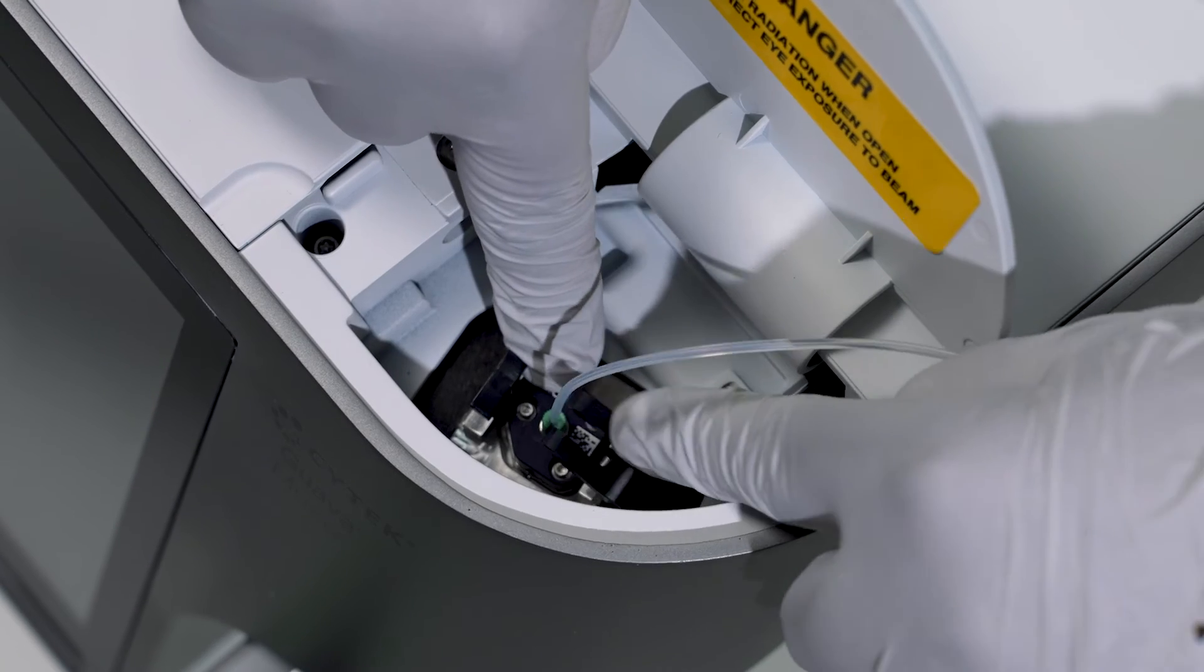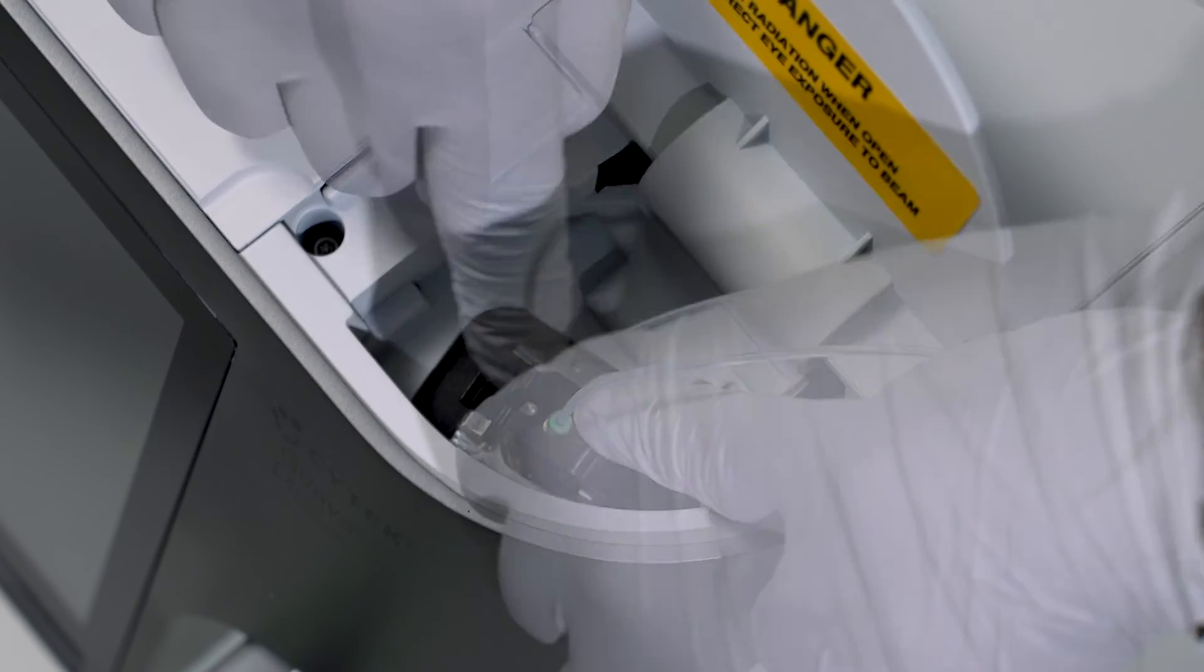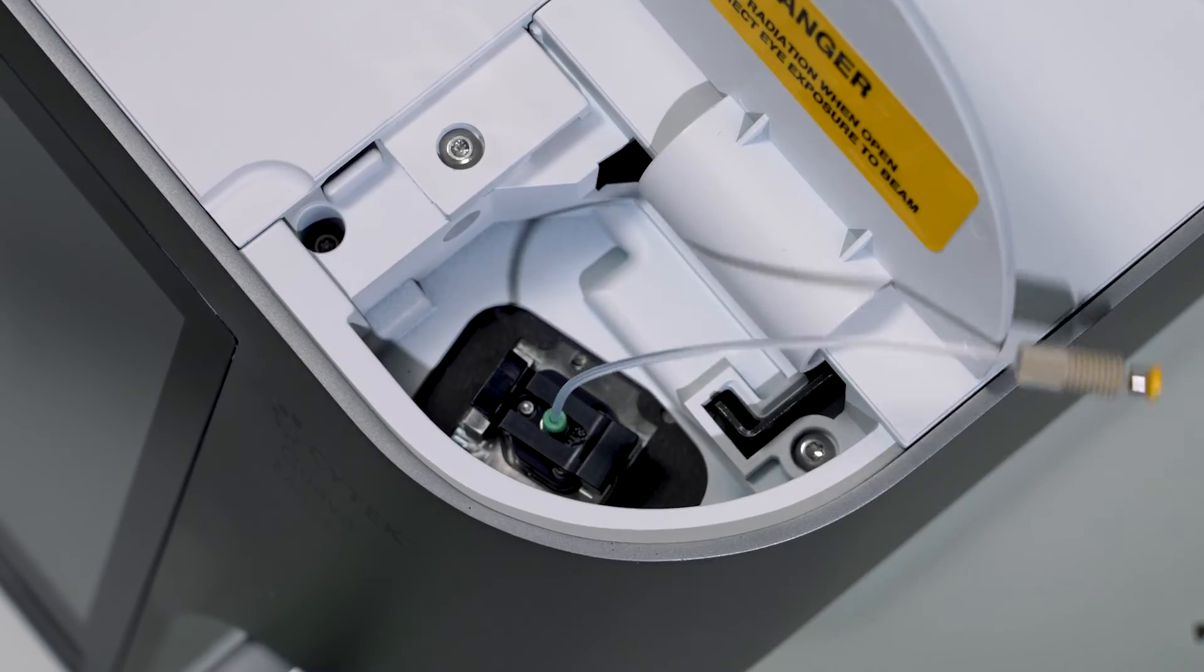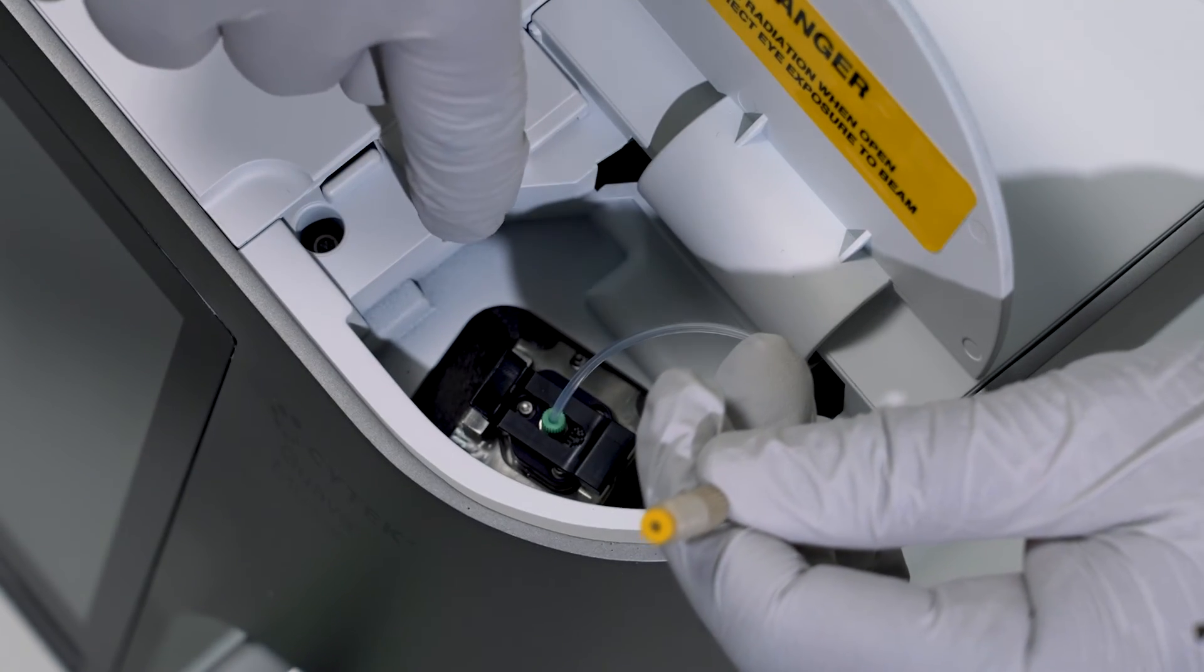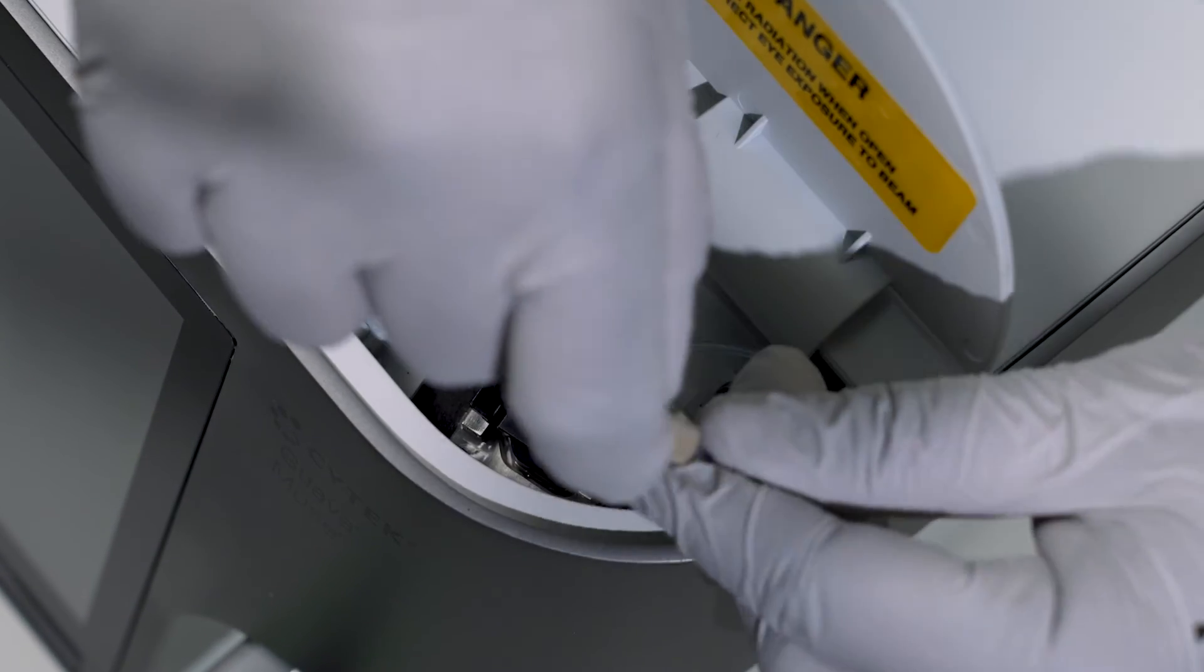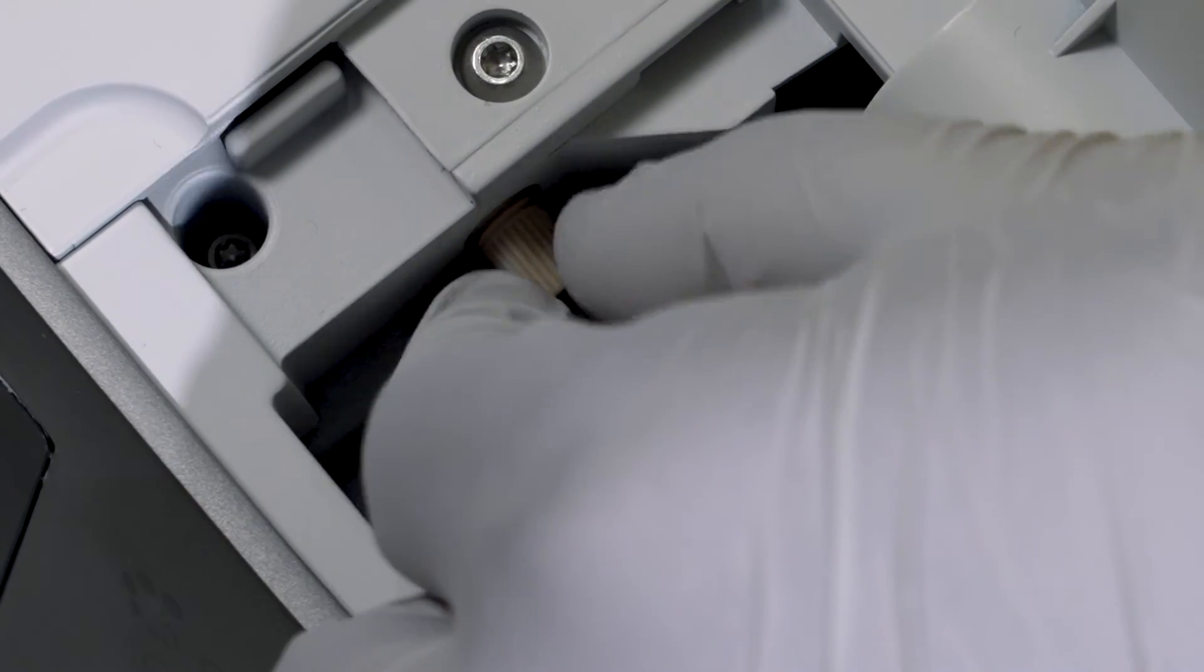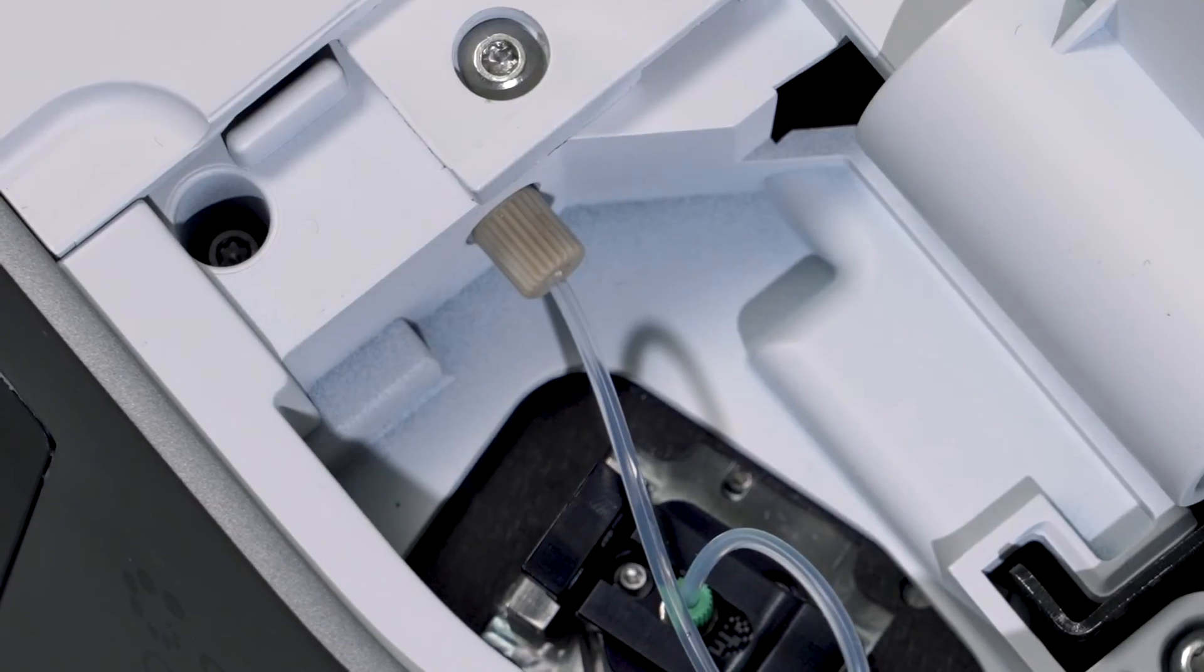When the flow cell is seated properly, close the clamp to secure the flow cell in place. Now connect the flow cell tubing to the fitting next to the flow cell chamber. Securely tighten with your fingers or use the tightening tool as necessary.